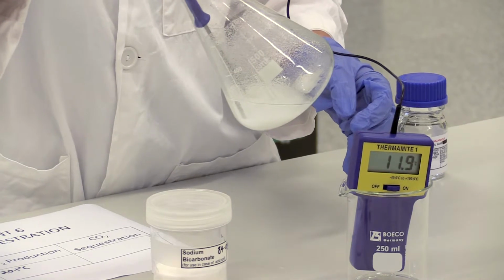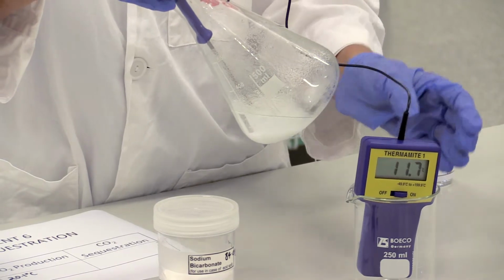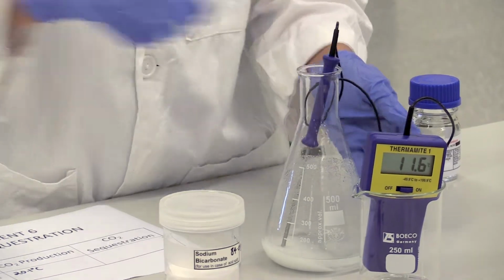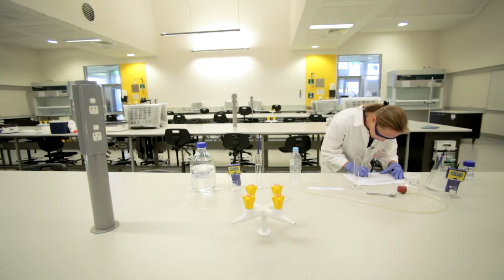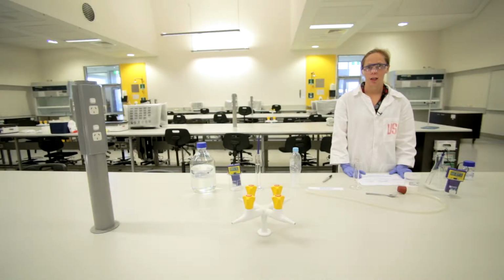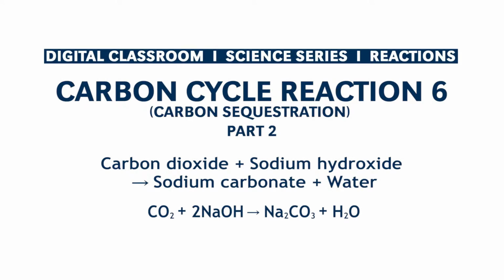So if you recall, our initial temperature was 20.1 degrees Celsius. 11.7 degrees Celsius. So our final temperature is 11.7 degrees Celsius. So we've observed a decrease in temperature of the reaction, so it means that the reaction has absorbed energy as it's proceeded, so we've got an endothermic reaction.